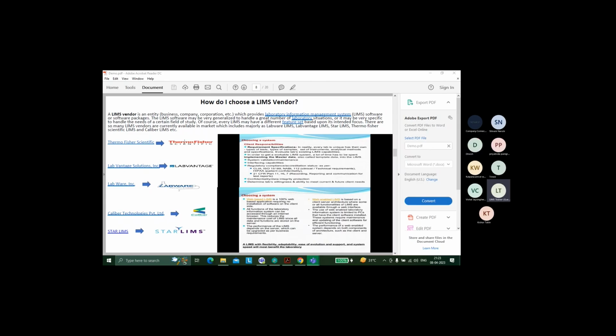Because pharma is a very regulated environment. Each and every step which you do in production must be audited, right? Because if something goes wrong somewhere, that is not acceptable in the pharma industry, right? Even if it goes wrong, you have to be responsible and answerable for why it went wrong, right? It should be trackable. Everything should be trackable, right? So as of now, you understood everything, right?